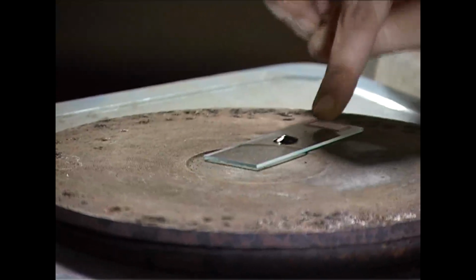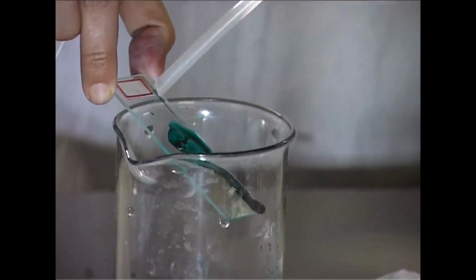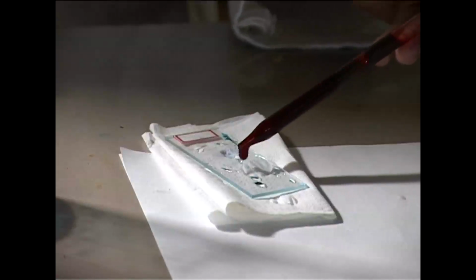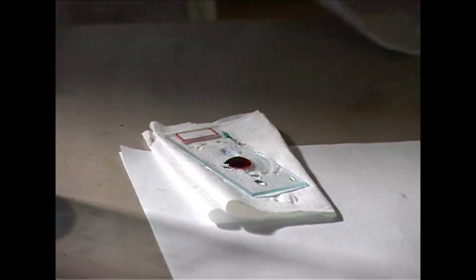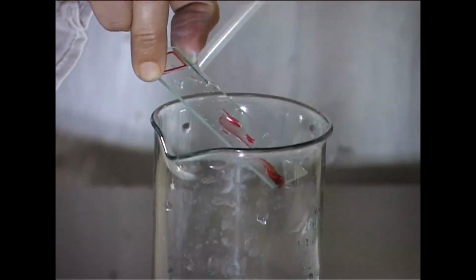Then after keeping it for 5 minutes, we cool it first and then wash it with water. And then we stain it with safranin, and again keep it for 1 to 2 minutes. Then we wash it with water, air dry the smear, and see it under the compound microscope.